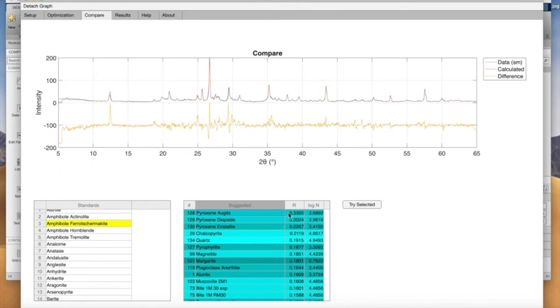So maybe we have some of that kind of thing, a clinopyroxene, in this sample, but since there's a solid solution between augite and diopside, the particular sample we have in there might actually be something that's in composition between the RockJock standard for augite and the RockJock standard for diopside.